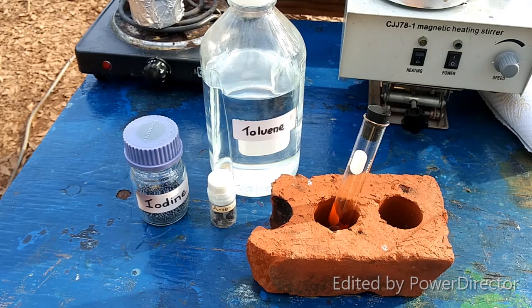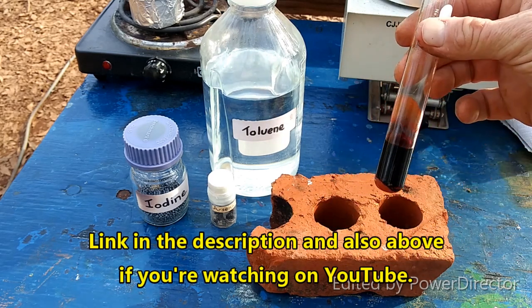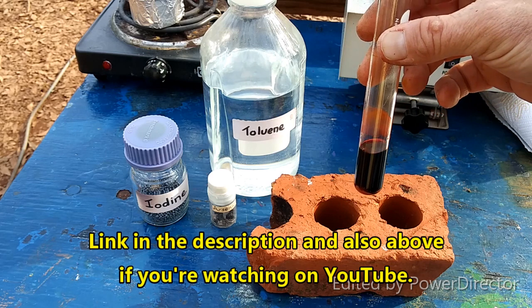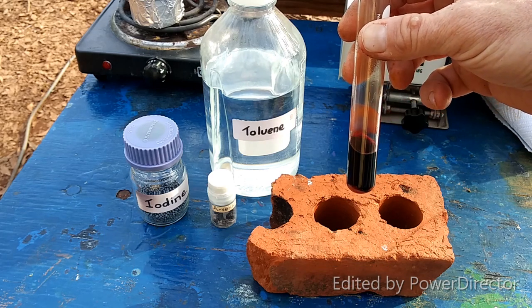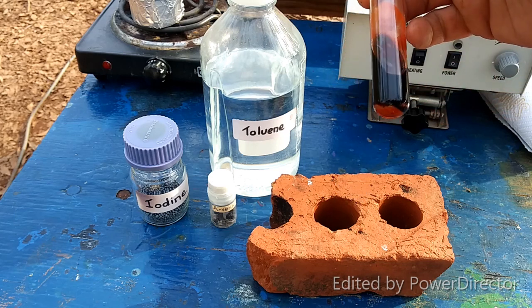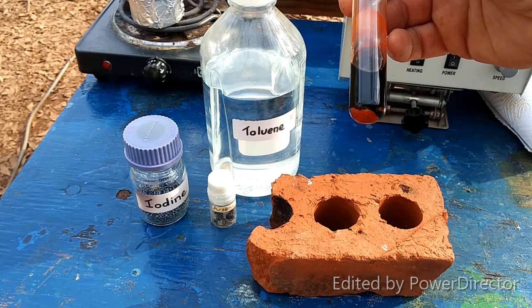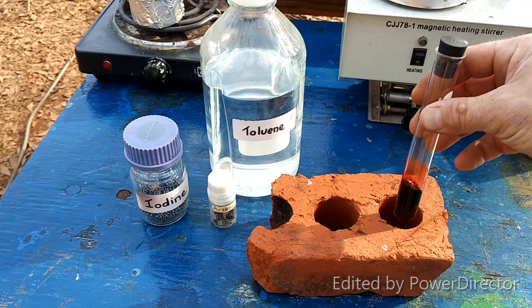The way that this is done is basically exactly the same way as the antimony triiodide was done. I already did a test run of it here, and you can see this deposit up here — that is the arsenic triiodide. You can see I've got a lot more of it crystallized out of the bottom.